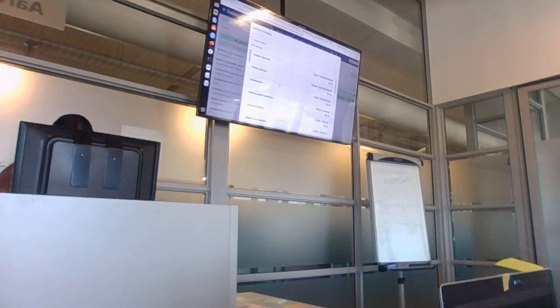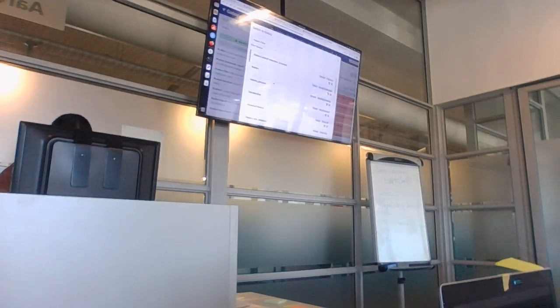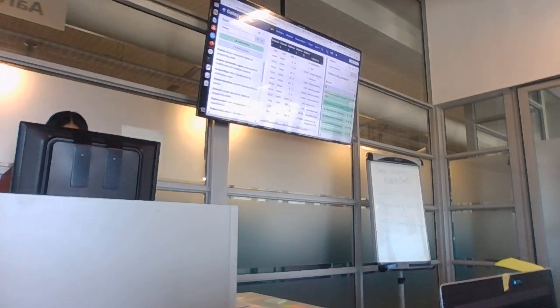If I can find the correct one now. Okay, so you will have a classification report. It's not this, yeah. I don't use this one.